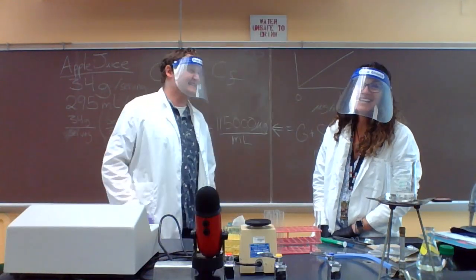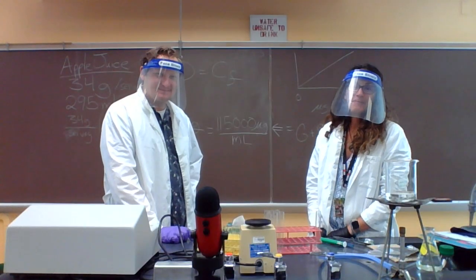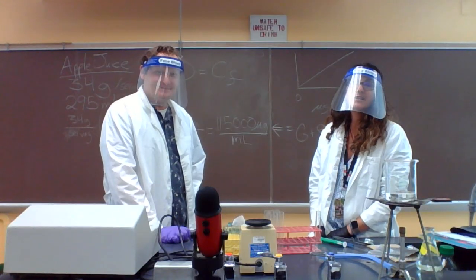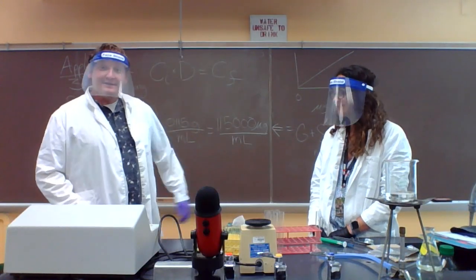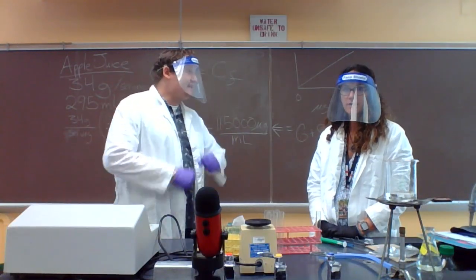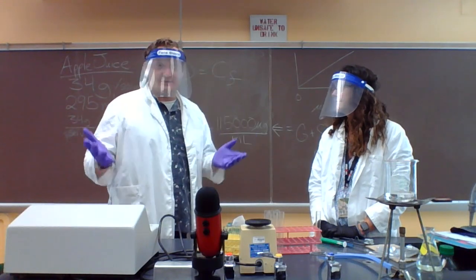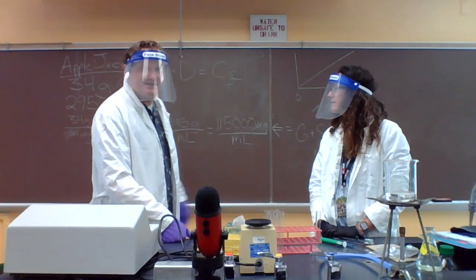So this is the second carbohydrate lab where we're going to be measuring the glucose concentration in beverages. The idea here is that we've now set up a standard curve for our assay. So now we can take any beverage, any sample, any fluid really, and we can determine how much glucose is present there. So there are a few things for us to go over.